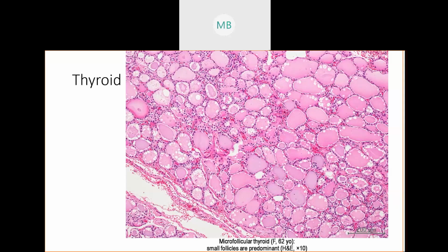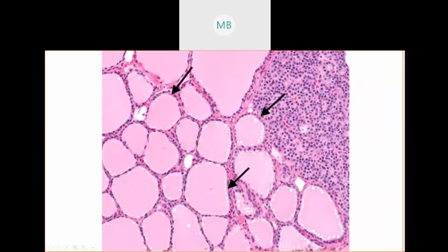So there's a few things you have to know about the thyroid. You have 4 things on your lab list that you need to know. First of all, you have the bubbles here. The bubbles are called follicles. A follicle is a tiny little bubble or balloon inside you that's going to store some chemical or store information. We'll get into that in just a second. But these bubbles are all called follicles. So we know that the bubbles are called follicles.